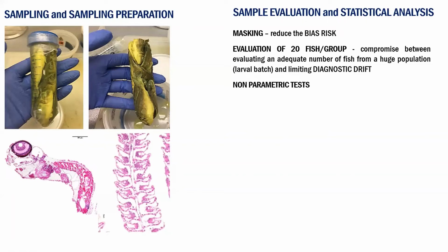The semi-quantitative scoring system depends on the judgment of an evaluator, exposing the evaluation to some level of bias that can skew the final data and conclusion. Therefore, some precautions have been taken in order to constrain these biases. The risk of having judgment subliminally influenced by information from the study belongs to the expert at every level. And so it's very important to start with the blind observation of the sample. In this way, it's possible to reduce this risk.